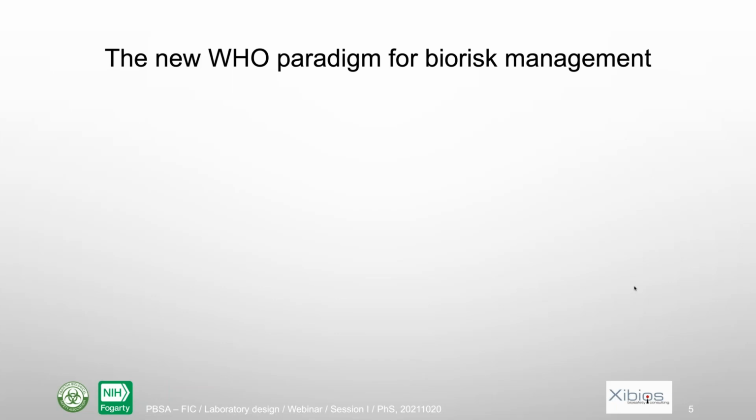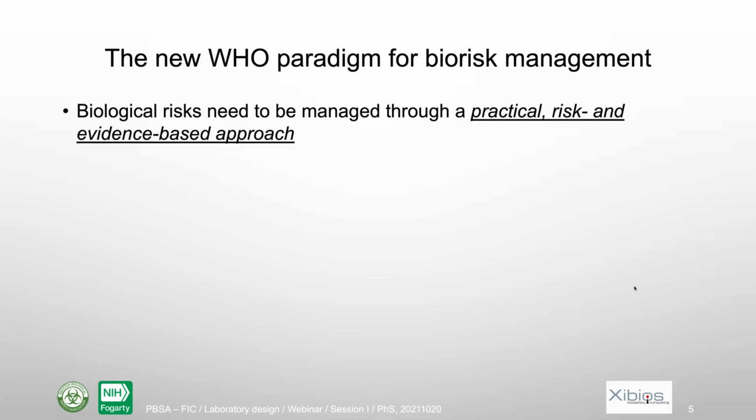So what does WHO say about biorisk management? First, biological risks need to be managed through a practical, risk-based and evidence-based approach. So it's not based on some codes and some rules and so on. It needs to be controlled using a very pragmatic approach, I would say.